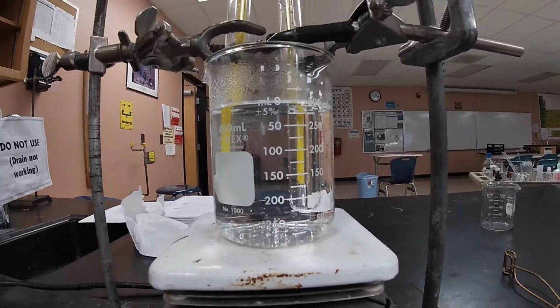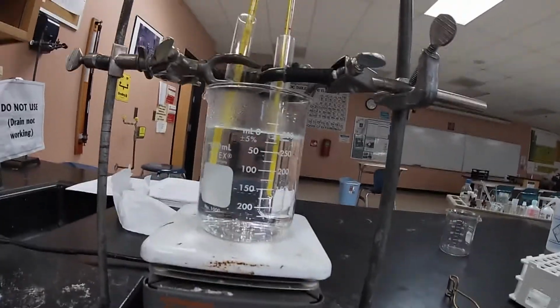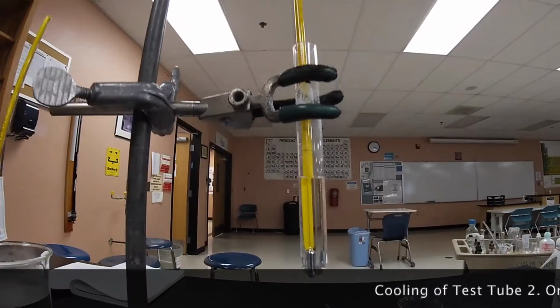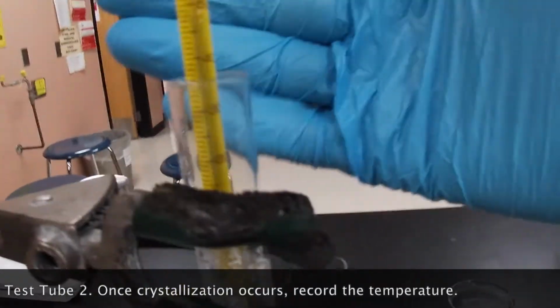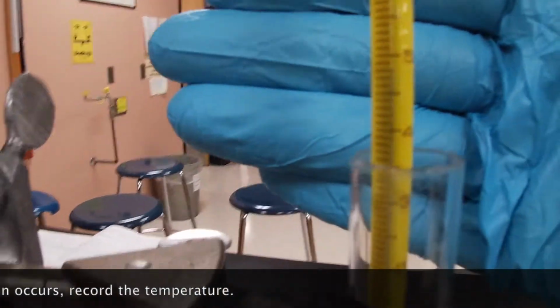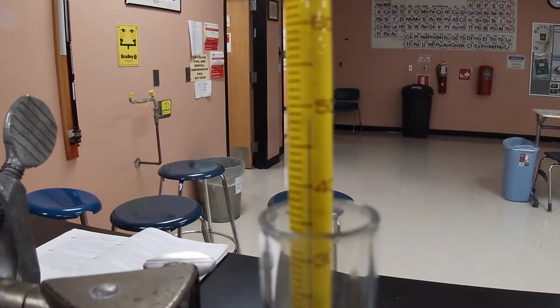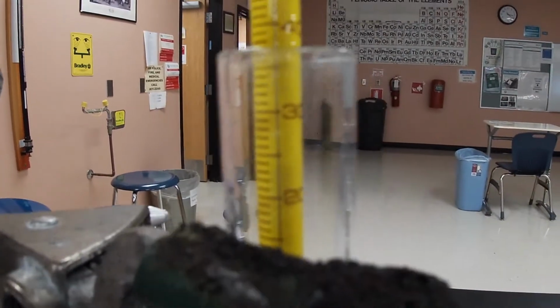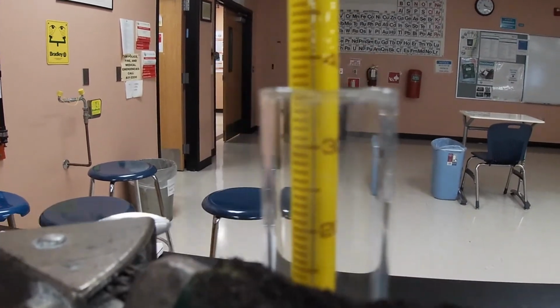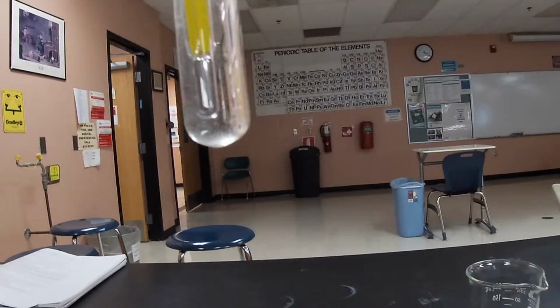So now what we're gonna do is remove it from the heat. And as we remove it from the heat, we're gonna just allow it to cool. Okay. So here we're gonna go ahead and record the temperature. The temperature is at about, oh man, come on now. It's at about 58, 59. Yeah, 58, 59. And that's the temperature of the solution where the crystals started forming already.